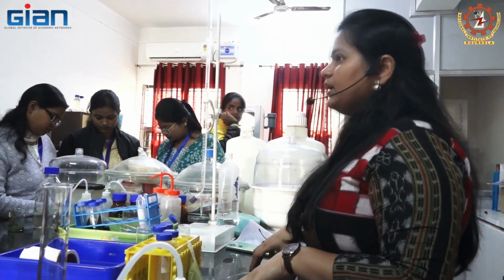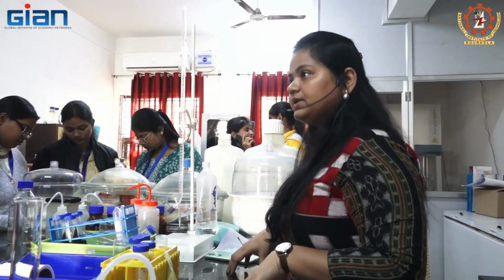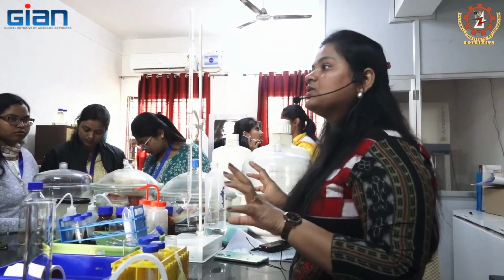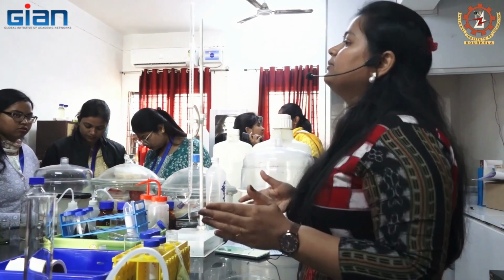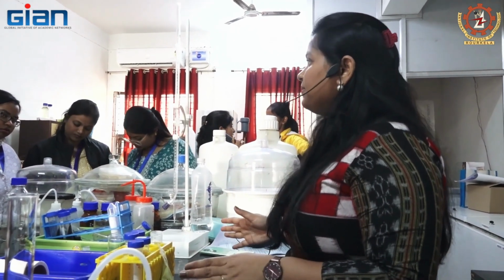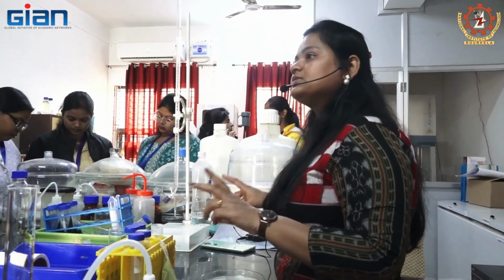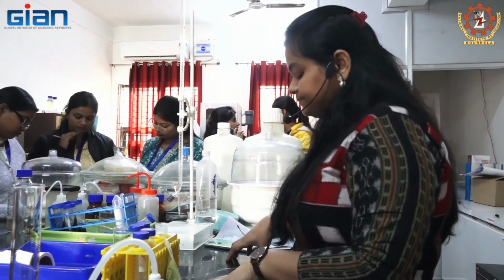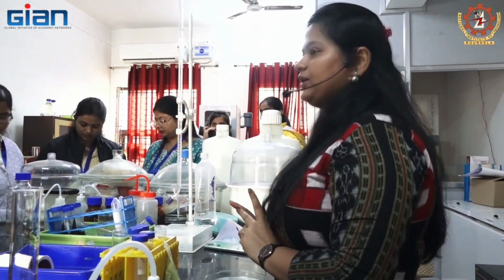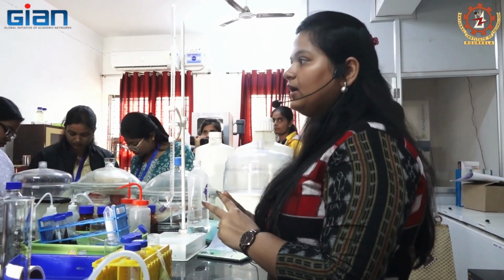the microwave, because in the oscillating electrical and magnetic field, the polar compounds or polar factors inside the solvent as well as the samples can interact with the microwaves, only the polars and ions present in it. So non-polar compounds and non-polar solvents cannot be used in microwave assisted extraction. That is the bigger challenge in microwave assisted extraction. Then there are two principles working for microwave assisted extraction. One is dipole rotation and another is ionic conduction.